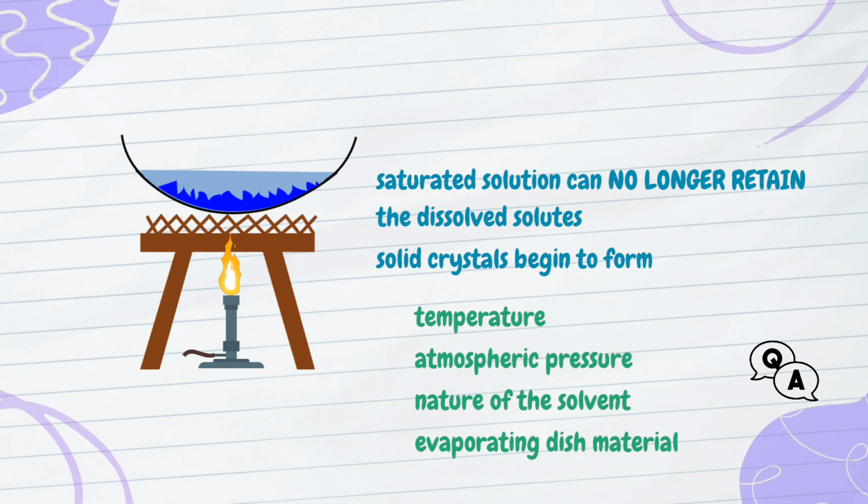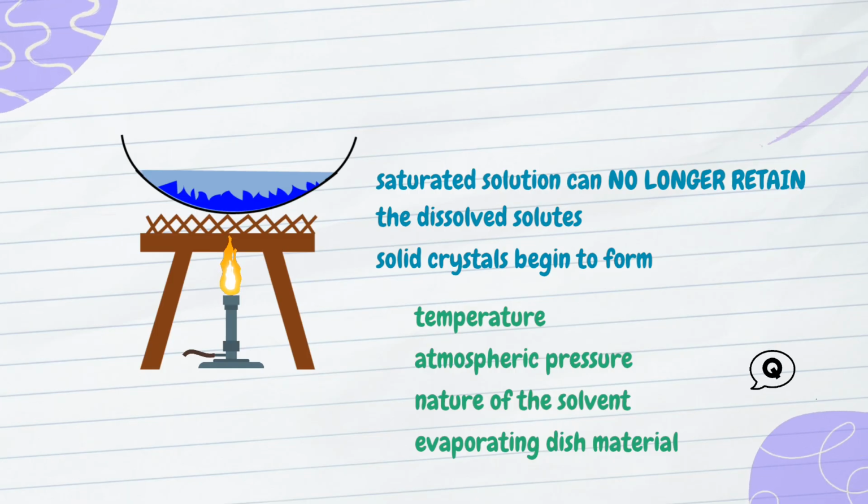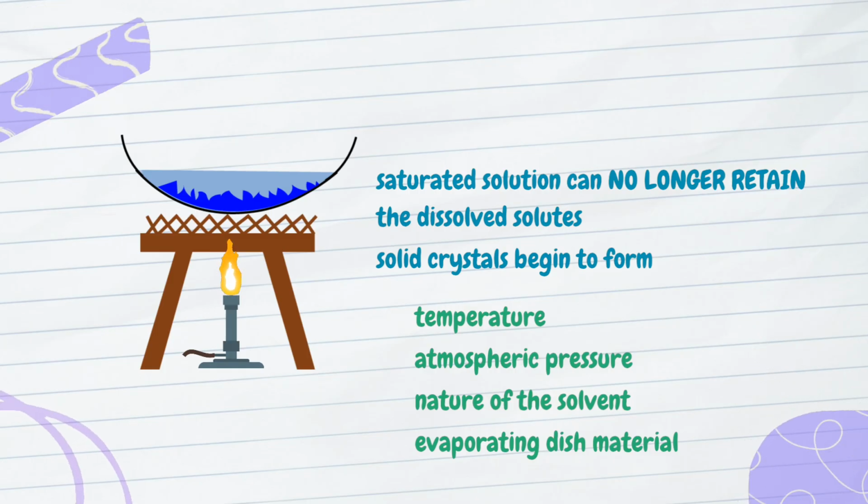In scientific applications, the obtained crystals can serve various purposes, from further analysis and characterization to the production of pharmaceuticals or the purification of substances for research purposes.